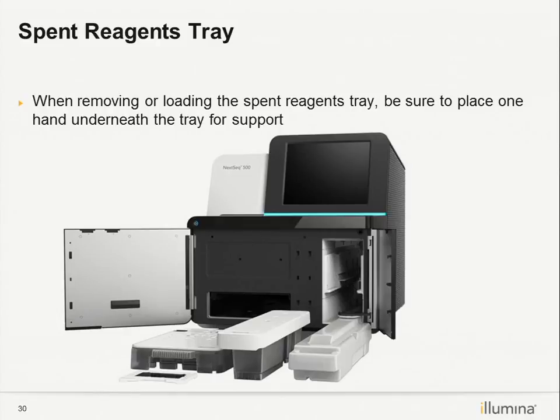And the instrument is quite small actually, and you can see this is a pre-built computer, and it's a touch screen, so you can just use your finger and touch, and then ask it to go through the sequencing. And we have a main switch at the back, in the left upper panel, and this is the main switch for the computer.